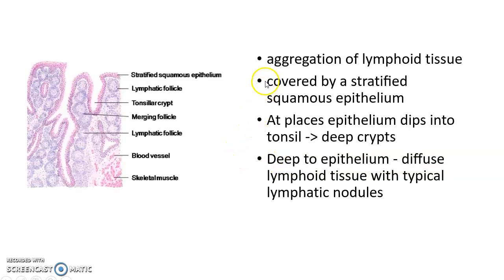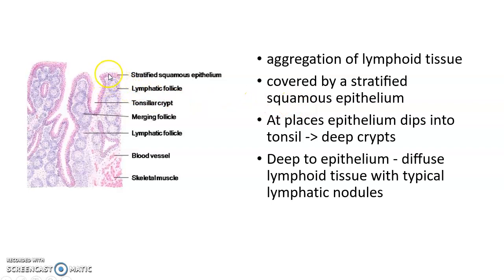Palatine tonsil consists of an aggregation of lymphoid tissue. The main feature of palatine tonsil is that it is covered by stratified squamous epithelium. As you can see in this picture, it is covered by stratified squamous epithelium.